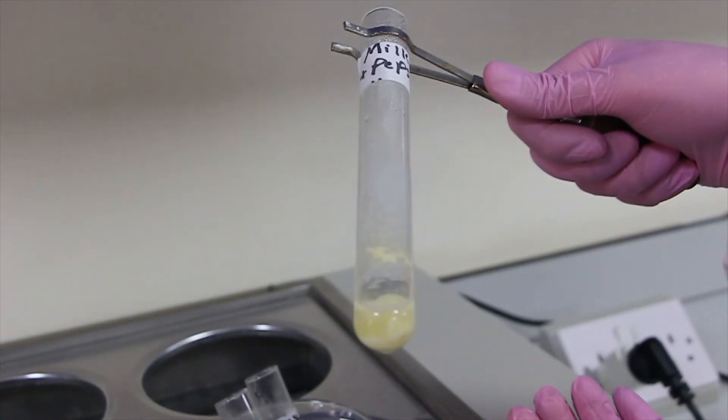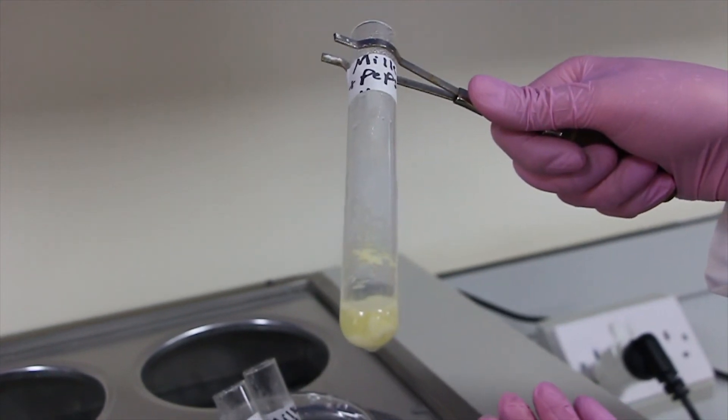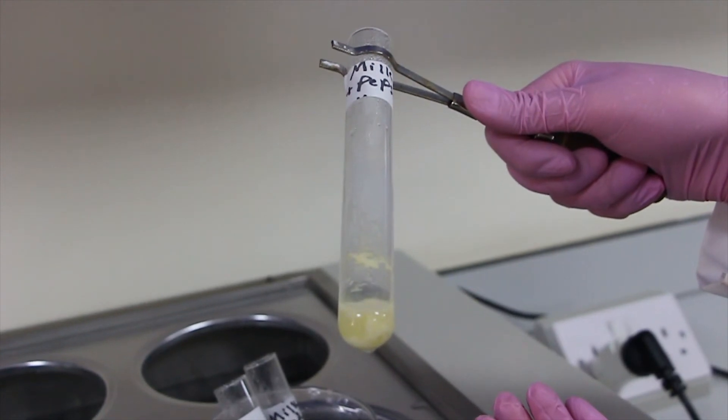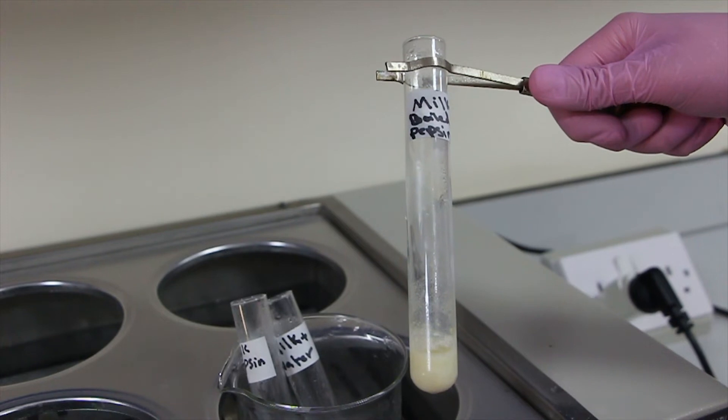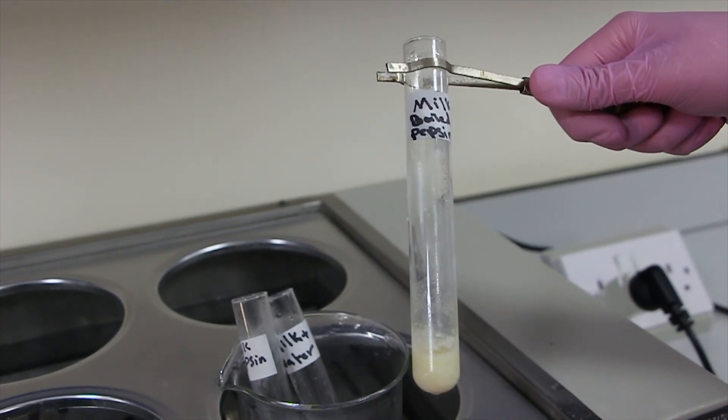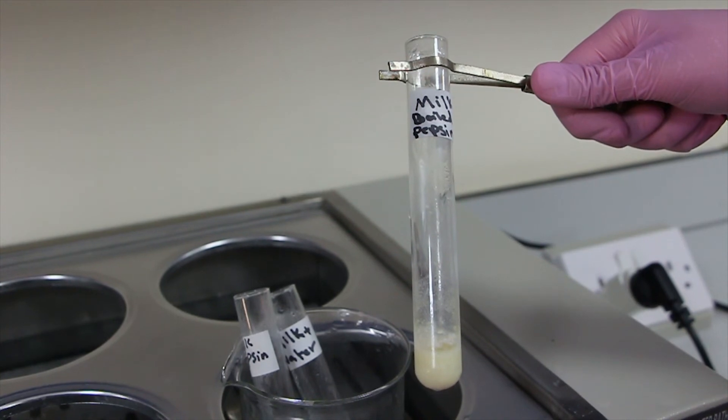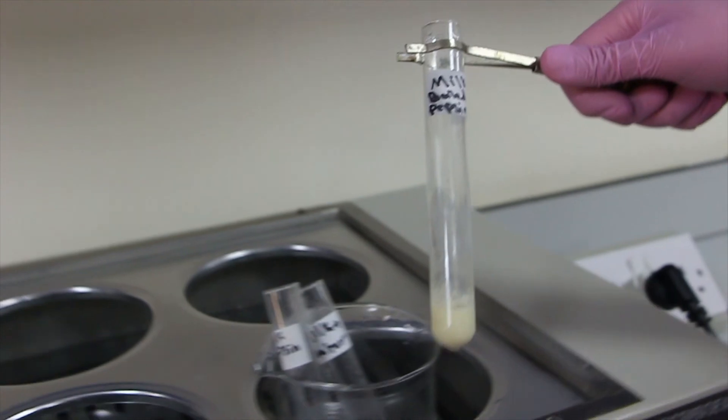If you add pepsin to milk, you can expect the pepsin to start digesting the proteins into smaller polypeptides in the form of coagulation. But if you add boiled pepsin to milk, you can expect no changes, no coagulation, because when you boil the pepsin enzyme it will be denatured, so there is no effect of pepsin on milk.